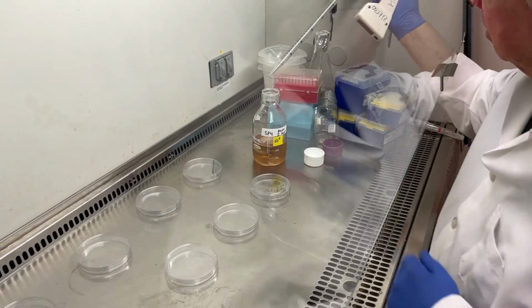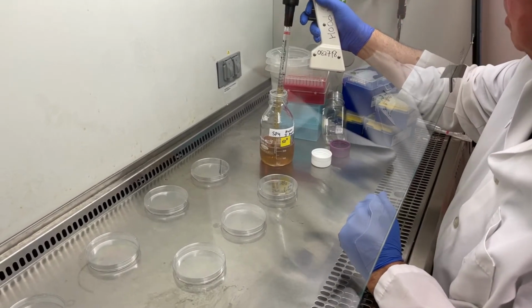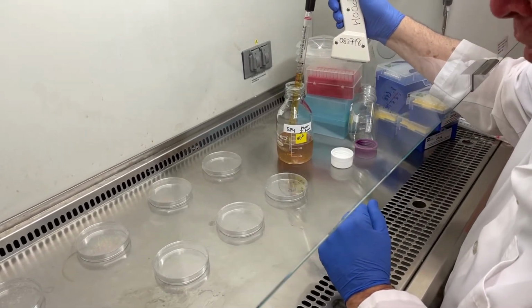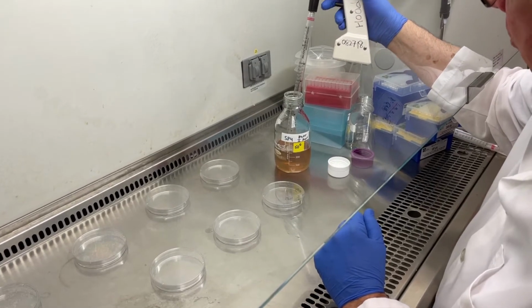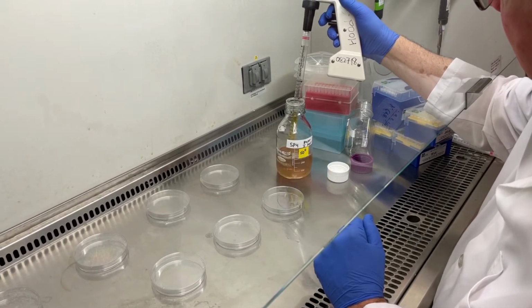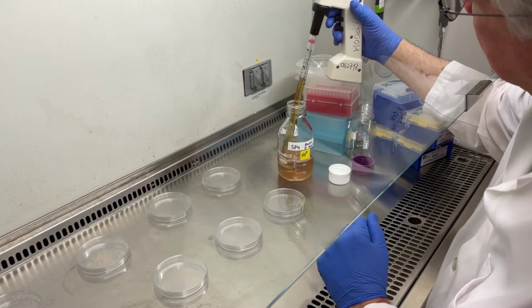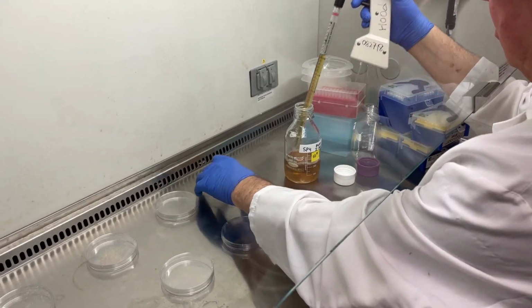These are 100 by 13 millimeter Petri dishes, and that takes about 25 mLs of the agar medium. To do that, we either pre-warm the pipette or bring fluid in and out of it a few times to warm it, and then use a 25 ml pipette, loading it to about 26 mLs or so.